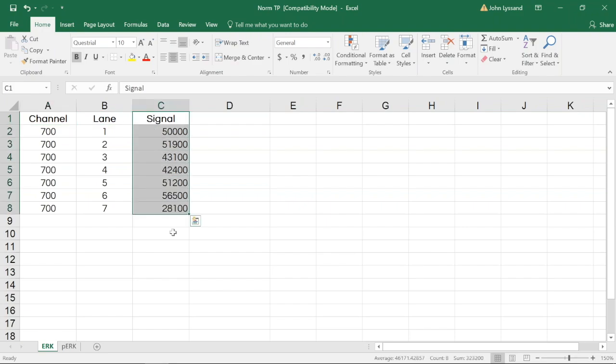When looking at the value from lane to lane, we can see that there is variability in the amount of ERK protein that transfers to the membrane, highlighting the importance of doing this normalization step.